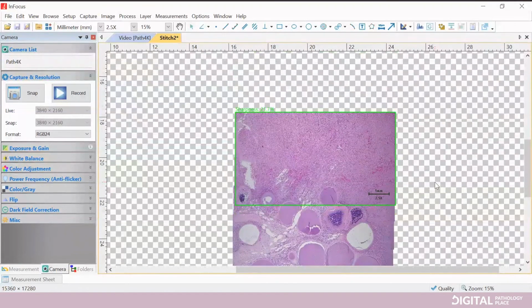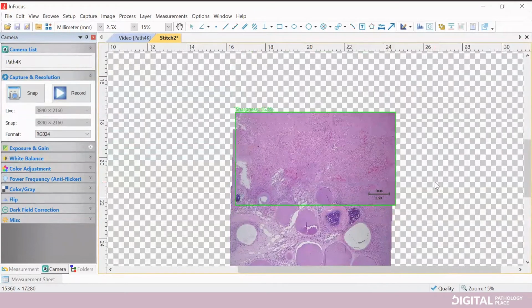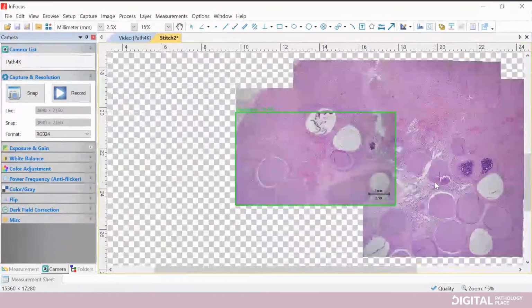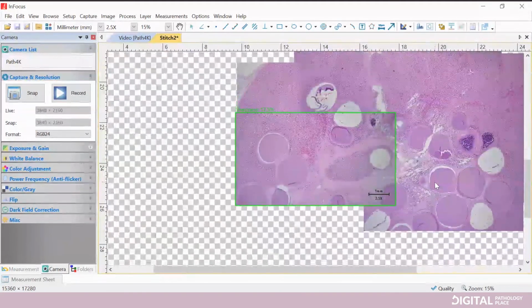Okay, let me go. And then back down here. Yep, doesn't matter which way you go. Okay, and I don't even have to look into the microscope. That's cool. And then go down. Yep, you want to leave a little bit of overlap. So it's just looking at a pattern recognition in the algorithm. So any good H&E stain slide would work well.